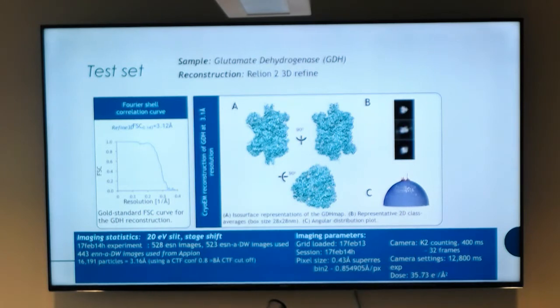So the computer programs from when we first started using Relion 2 to, let's say, CryoSPARC 2.11, which we'll be using, and Relion 3, there are additional features that you can even push the resolution beyond where we were. A few of the parameters that might be of note would be our dose for the full movie is 35, 36 electrons per angstrom squared.